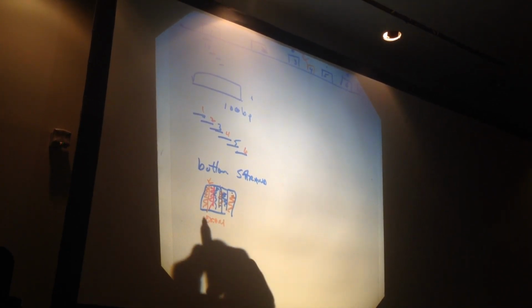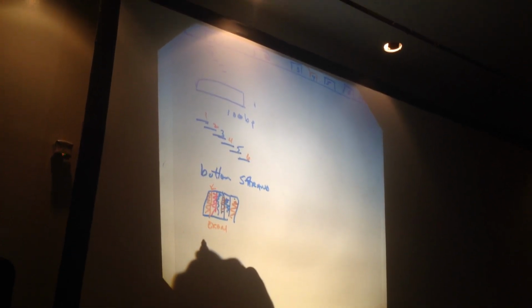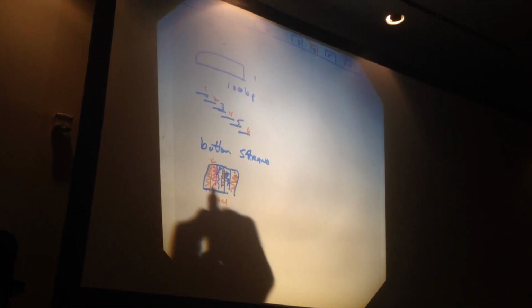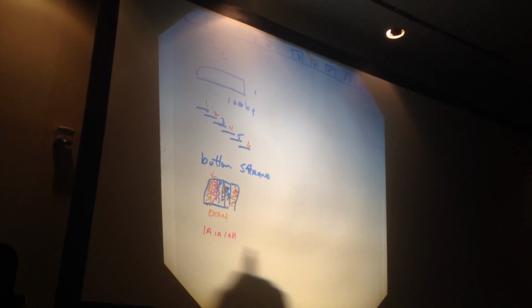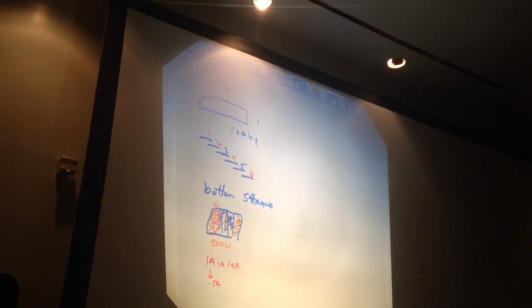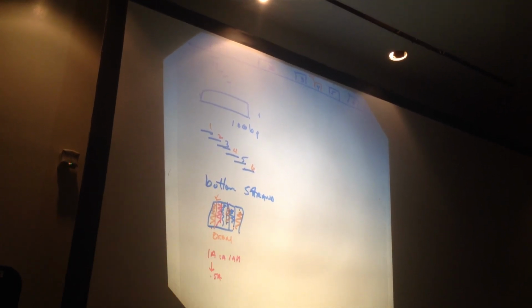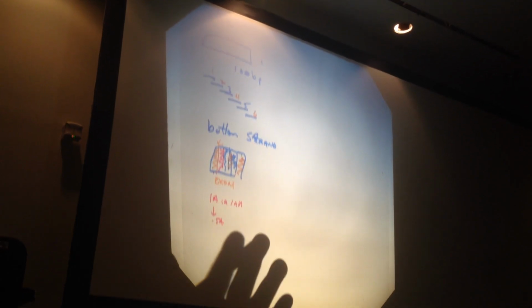Let's say, for example, I'm not a physicist, but let's say you got 1 amp of current going through each of these chambers, each of these little wells. Now you add RNA, and maybe this one goes down to 0.5 amp of current that can go through. So you can measure that difference. Yeah, they don't tell anybody their technology. They just say it in crude ways because they don't want to give out secrets.